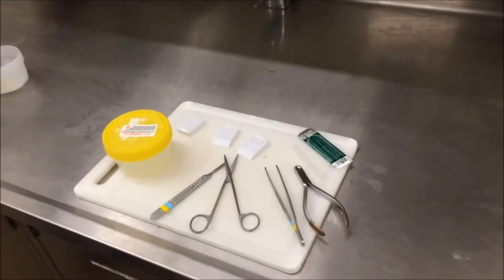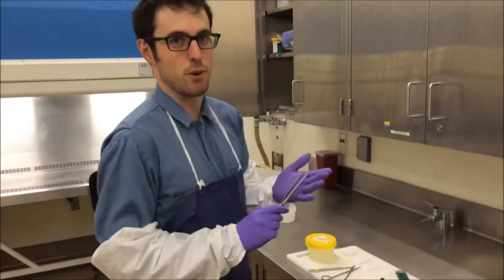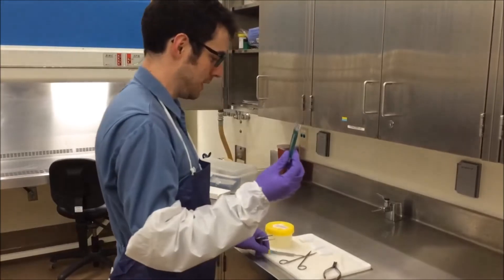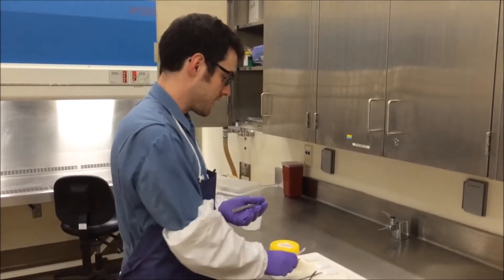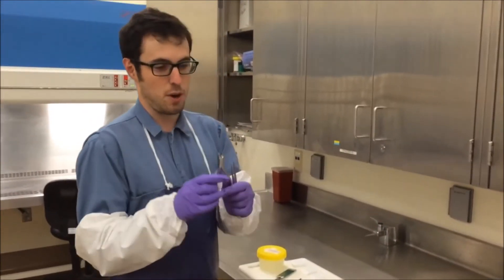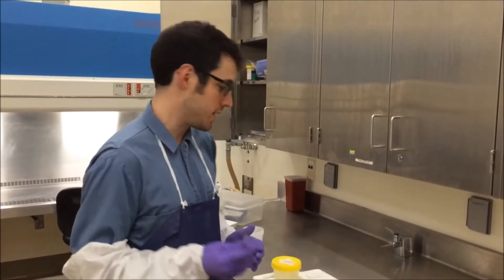So these are some of the instruments that we use when we do the necropsy on the bat. Here we have a pair of forceps and we generally just use this to grip onto any tissues during the autopsy. We have scalpel blades and the scalpel handle which we use to dissect the bat. We have scissors, commonly used to cut out specific tissues. And we also have the small pair of rongeurs which we use to open up the skull of the bat to remove the brain so we can send it away to test for rabies.